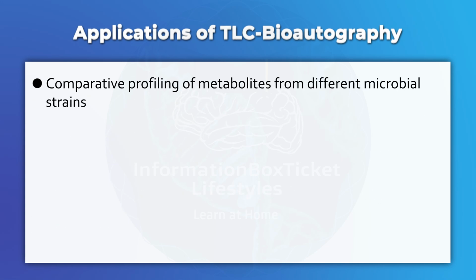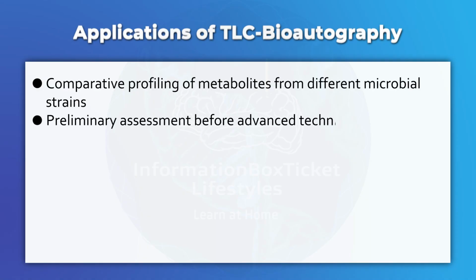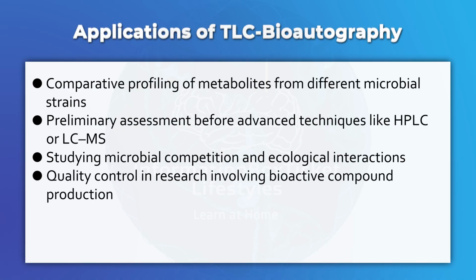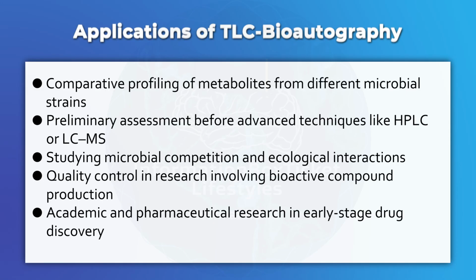Comparative profiling of metabolites from different microbial strains. Preliminary assessment before advanced techniques like HPLC or LCMS. Studying microbial competition and ecological interactions. Quality control in research involving bioactive compound production. Academic and pharmaceutical research in early-stage drug discovery.